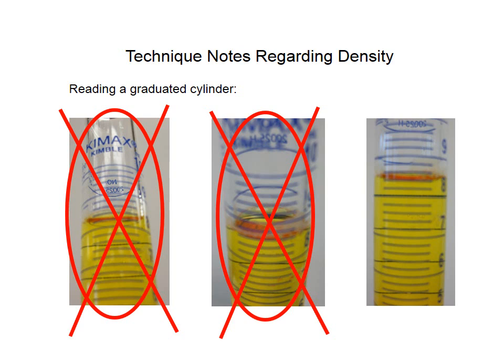But if I look in here, what I see is this meniscus down here. It's a little bit of a low spot in that liquid. That's where I want to read the graduated cylinder. Now in this particular case, it's right about on this line right in here. If you look at the graduations, here's 8, here's 9, and so this looks like 8.2, 8.4, 8.6, 8.8. So if I'm going to read this, I'm going to point out it's right on the line. So now I'm going to write down 8.40 milliliters like I have down here at the bottom.